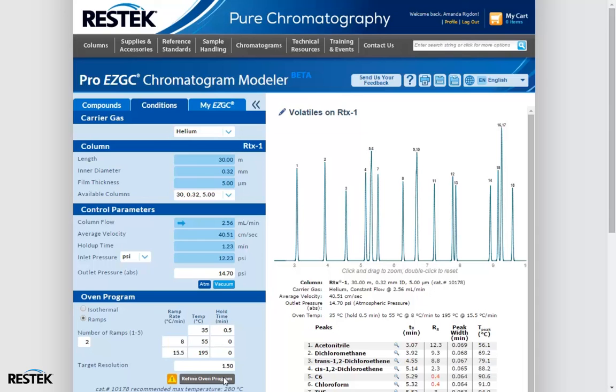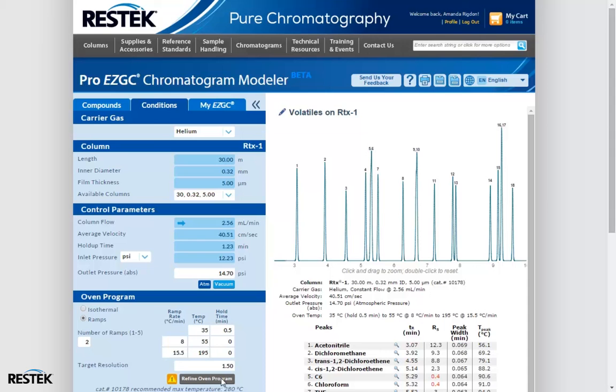The second reason is simply that surveying all possible permutations of an oven program in one go takes a lot of computing power. It can be done and in fact that's pretty much what ResTech's previous version of the chromatogram modeler did, but the processing time can be a little on the long side. Now that we know what the Refine button does and we've exhausted its usefulness for this iteration of the model.